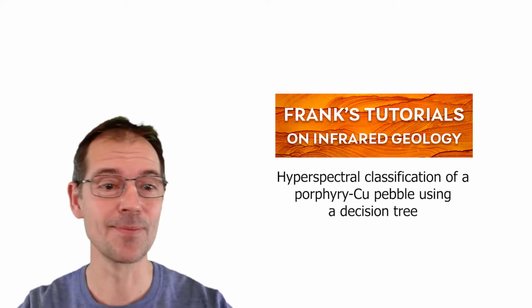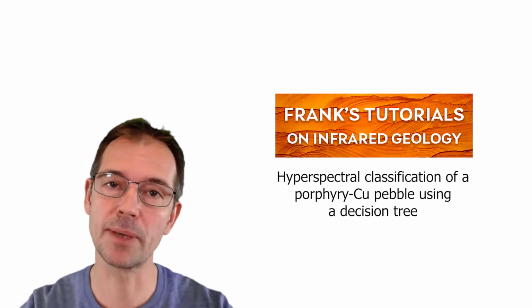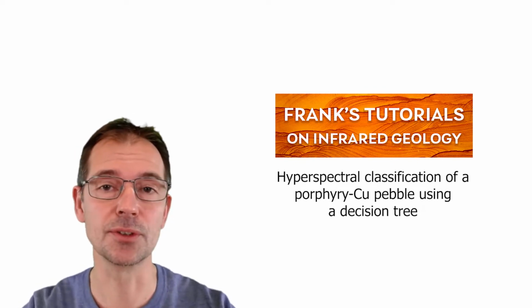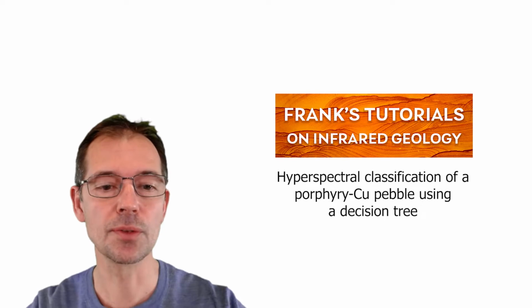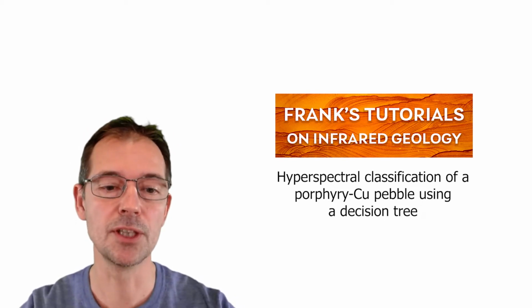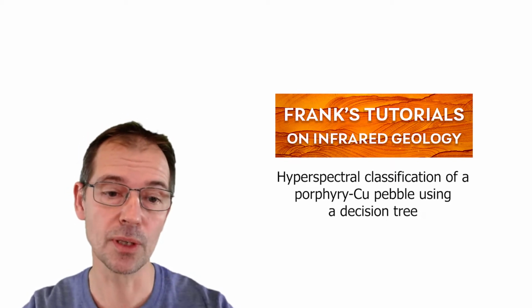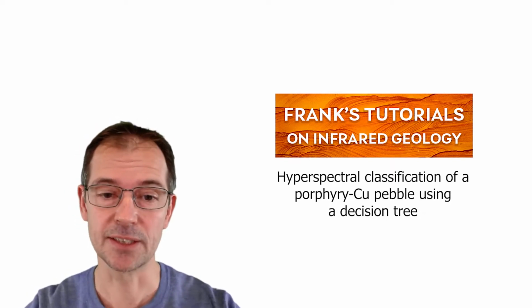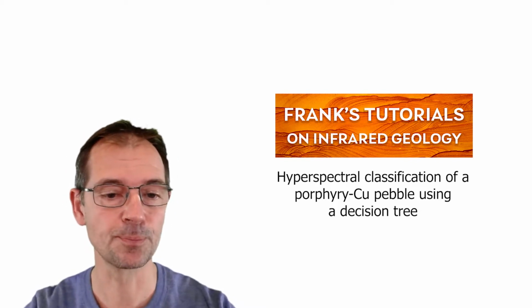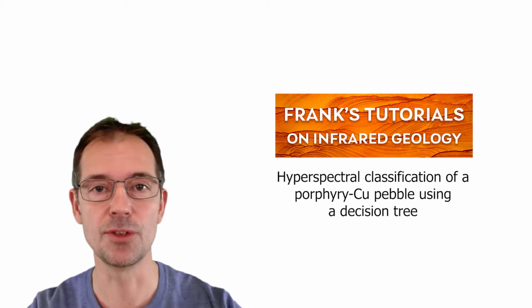My name is Frank, and in this video I will review a desktop tutorial on hyperspectral core scanning that I've published on my website frankstutorials.nl. The tutorial is titled Hyperspectral Classification of a Porphyry Copper Pebble Using a Decision Tree. This tutorial follows up on the previous exercise, Spectral Mineralogy of Porphyry Copper Pebble. A review of that tutorial can also be found on this YouTube channel.